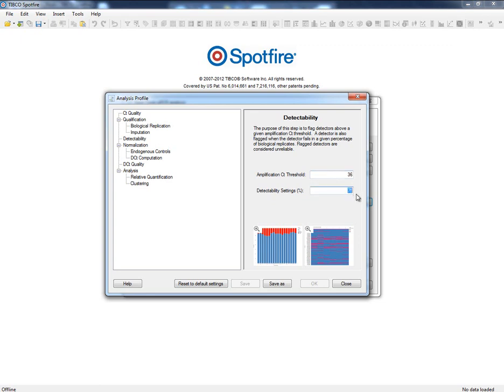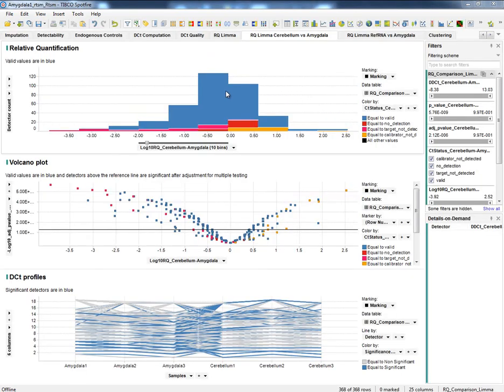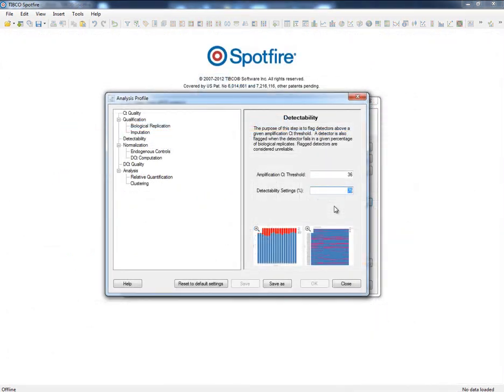According to this value, one biological group will be flagged for a certain detector if the percentage of flagged biological replicates is greater than the given threshold. All this information will be later reflected in almost all the differential expression reports, so we will have the chance to determine whether we can rely on these comparisons. As we can see, the reports use a color legend to highlight if we have detected inefficiencies in the amplification of target, control, or both biological groups.